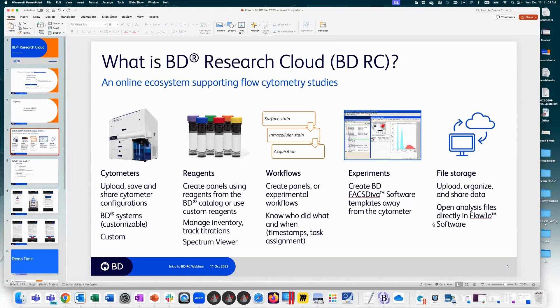The last item is file storage. Within BDRC, you can upload data directly to the cloud so it's accessible from anywhere. It has capabilities with FlowJo to connect to that data and download it locally, so you're not manually shuffling files around — FlowJo performance is best when files are stored locally rather than on a shared server.